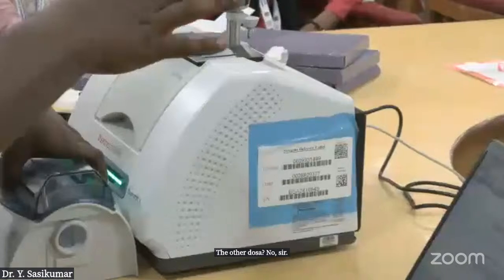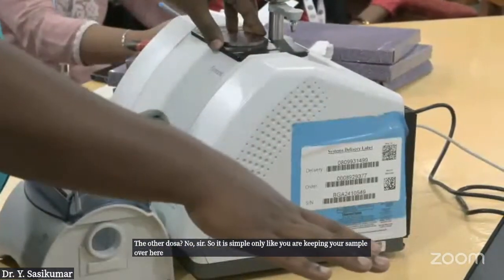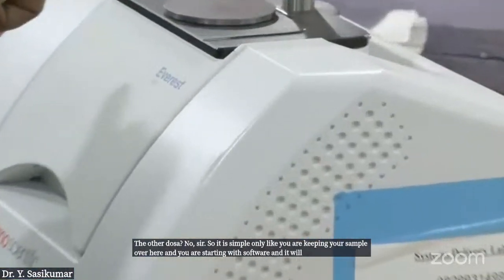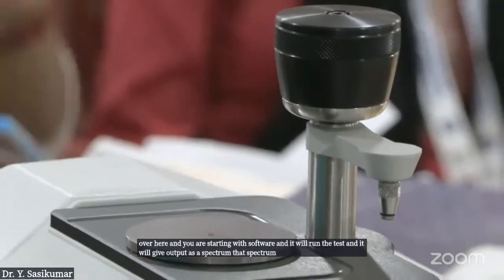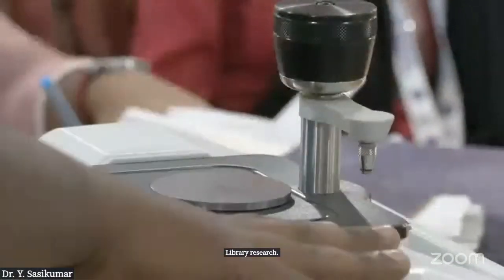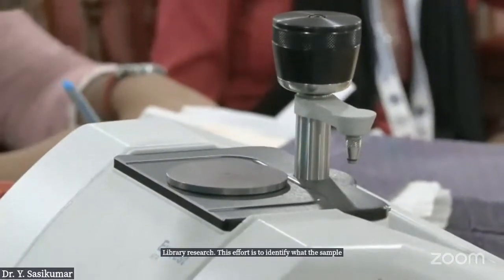It's very simple only. You keep your sample over here and start with the software, and it will run the test and give output as a spectrum. That spectrum, you will go with library search. This FTIR is to identify what the sample actually is.